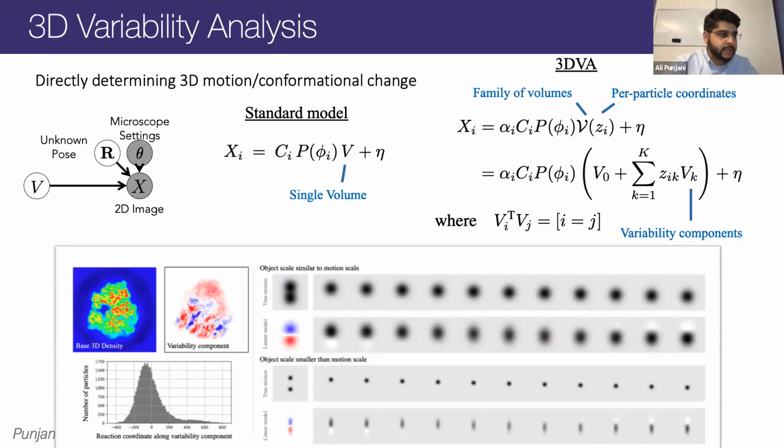Great question. It is very different because in this case, in the simple toy example that I showed here, there's no noise, there's no CTF, and there's no notion of 2D and 3D projection. So in the simple two-dimensional case that I'm showing here, what you're saying is right, that we could take the average of these structures and we could also compute, for example, their variance or a difference map or something, and it would look very similar to this linear model. And in fact, mathematically, they may even be equivalent.